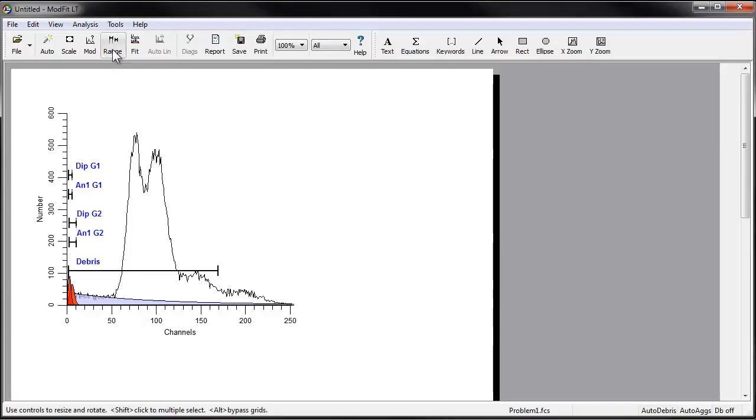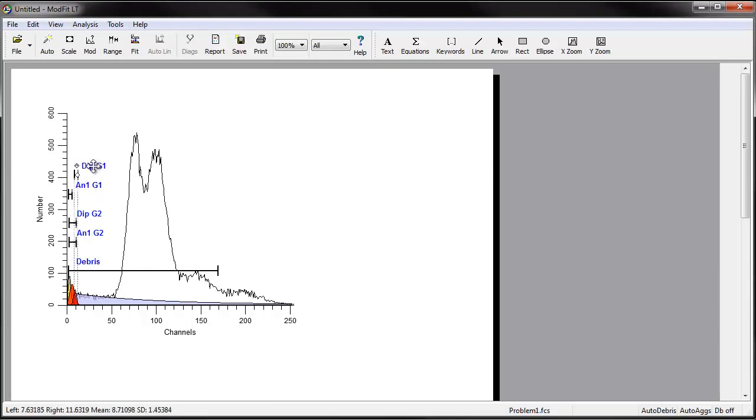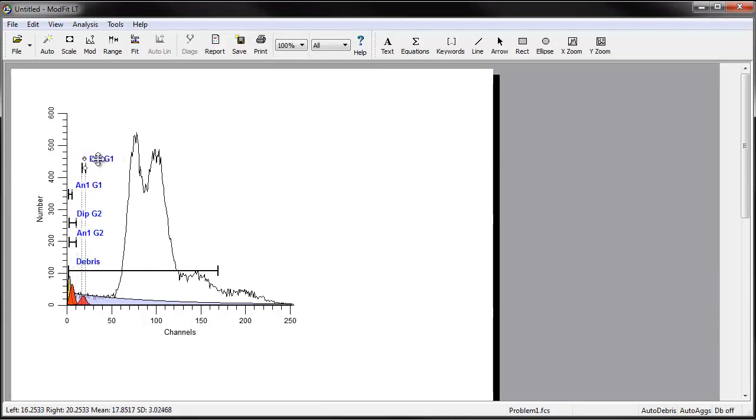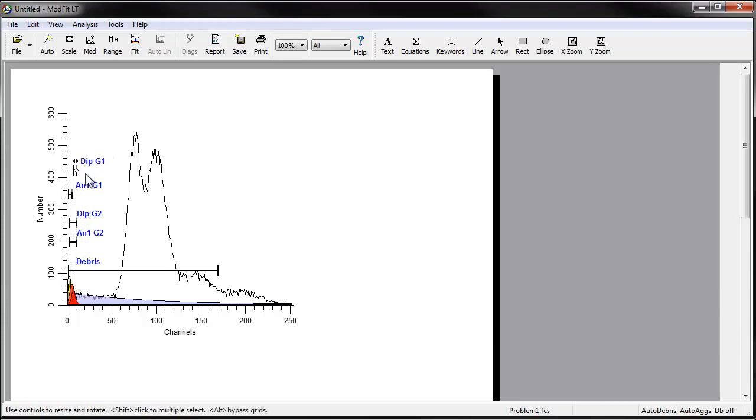In the Range view, you can position ranges over the peaks in the sample. You move a range by clicking on the range label and dragging it to a new location with the mouse button down. When finished, you release the mouse button. To adjust the width of a range, click the black handles and drag to choose a new size.